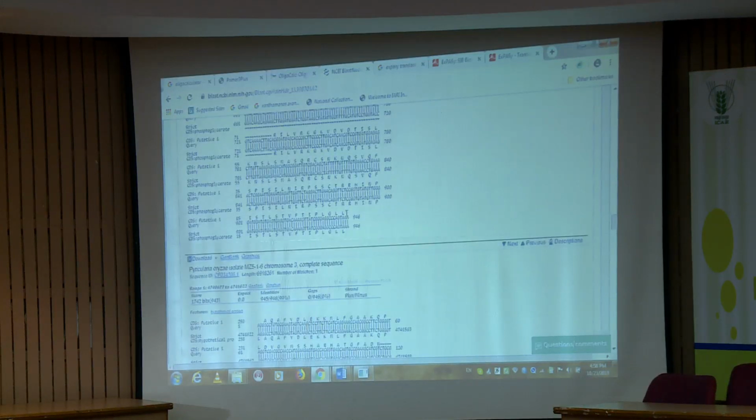The coordinates you mention should be correct, otherwise a single base will shift everything to a new thing, right? So you have to be very particular while doing this. Go with this format while doing the nucleotide BLAST, then select this option for CDS, so that simultaneously you can get this also, finally match and pick the correct translate, and then make your document. Got it?